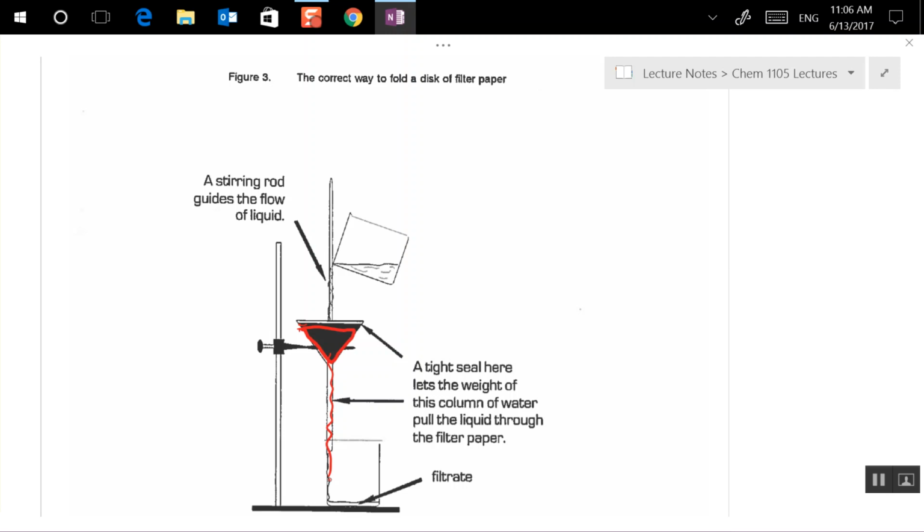If something starts to react, what do you know about the components that are in here? That there's an acid-soluble thing. Okay, and you go back to your chart earlier and you say, okay, what is the acid-soluble potential thing in my mixture? Then that acid-soluble thing will run through and out into here.